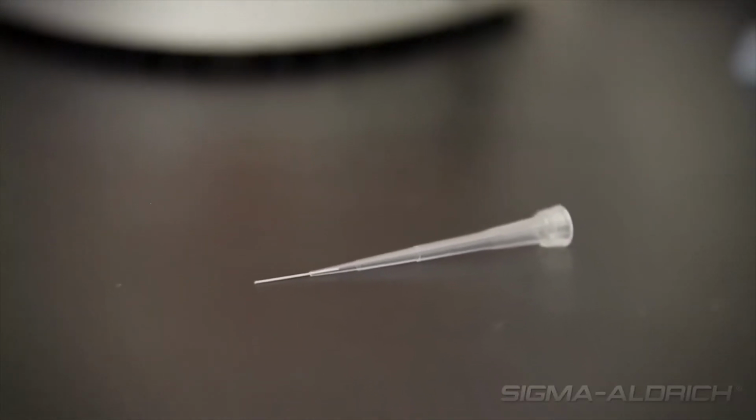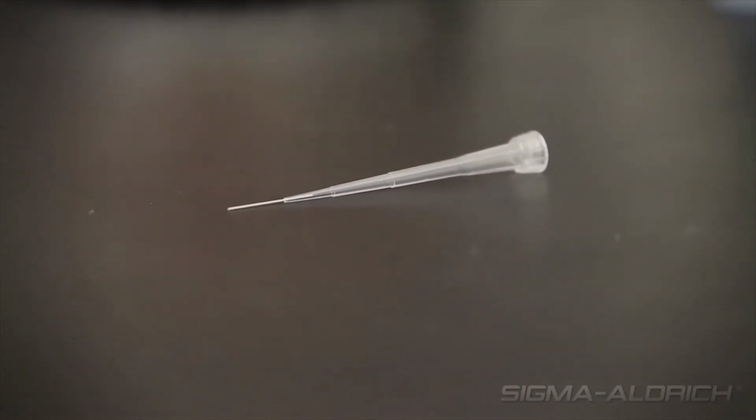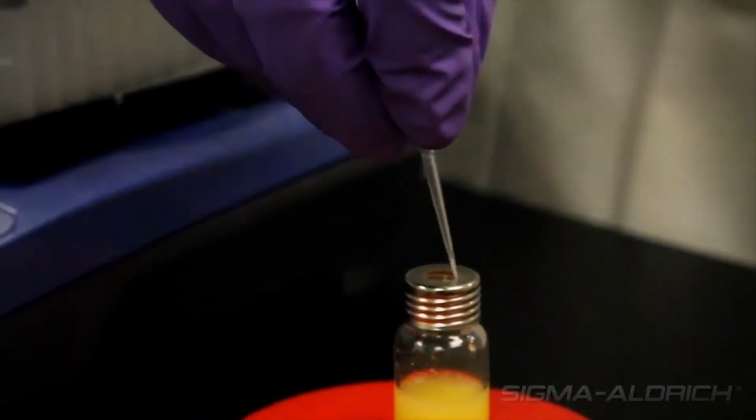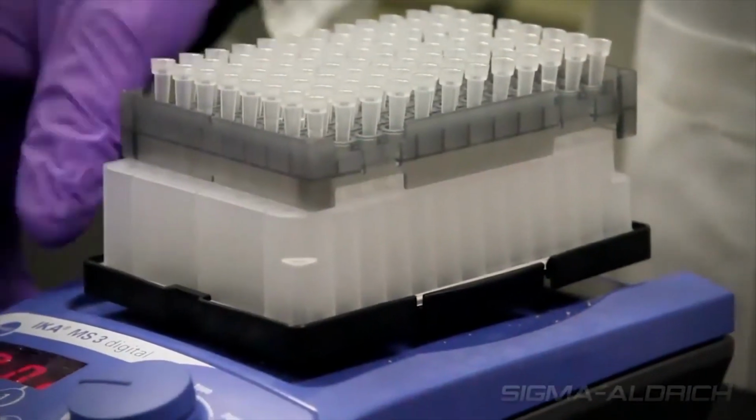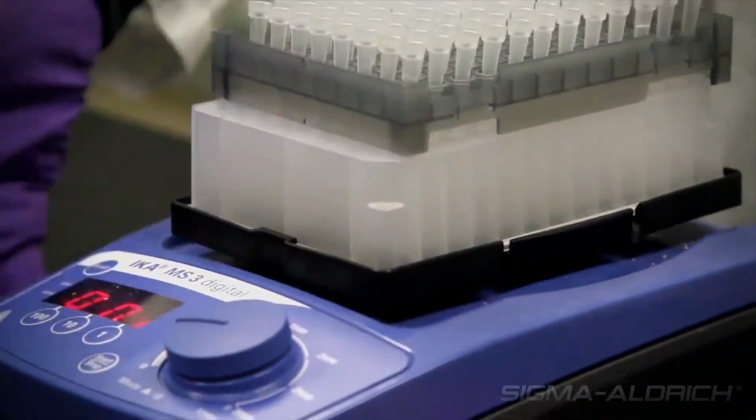Another format for these biocompatible SPME fibers is in a tippet format. The fiber is adhered into the tip of a pipette tip. So now we can set this up for robotics automation and for high throughput analysis. We can either do one sample or we can do 96 samples at the same time.